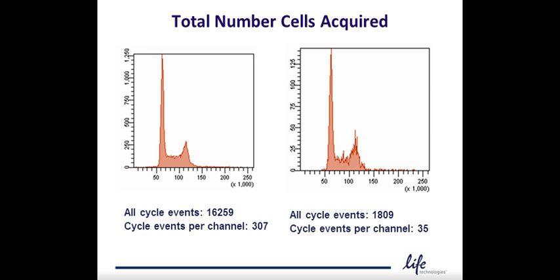If an insufficient number of cells are acquired for DNA content histogram, the accuracy of the analysis is impaired. Above 10,000 events per histogram, S-phase measurements are highly reproducible. Below 10,000, and especially with fewer than 1,000 events, the accuracy of the S-phase measurement deteriorates substantially.